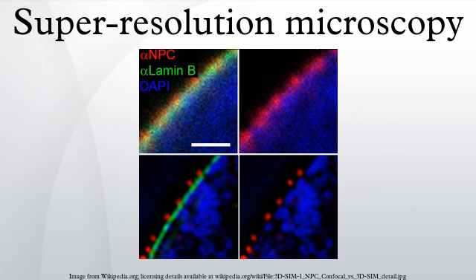Near-field optical random mapping microscopy, or NORM, is a method of optical near-field acquisition by a far-field microscope through the observation of nanoparticles' Brownian motion in an immersion liquid. NORM utilizes object surface scanning by stochastically moving nanoparticles. Through the microscope, nanoparticles look like symmetric round spots.